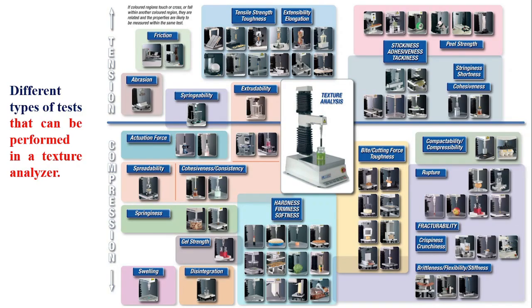There are multiple tests that can be performed using the texture analyzer. These are a few of the tests that can be performed, such as the stress relaxation test, toughness test, and hardness. We can also measure hardness, firmness, softness of the product, etc.